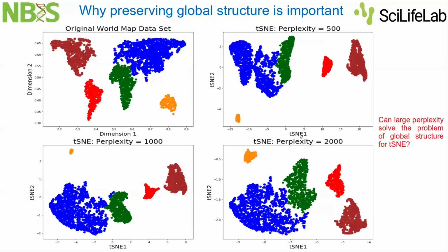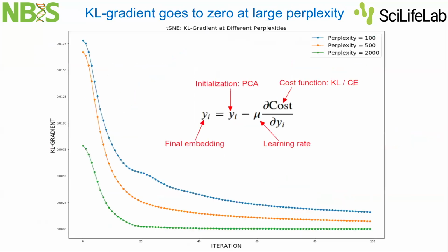And this was suggested as one way to make t-SNE and also UMAP preserve more of a global structure. You just increase perplexity and then you're fine. You can be more accurate with interpreting intercluster distances. This was what I heard from the t-SNE developers.